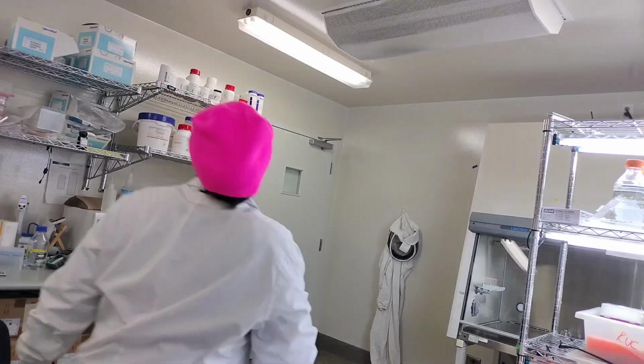This one calls for yeast extract, malt extract, sucrose, and agar. So it's sugar rich or carbon rich. Whereas maybe humans are trying to do low carb, some microbes prefer high sugar because they use it as an energy source. So I'm just going to grab the reagents for that, and then you'll see what I do.